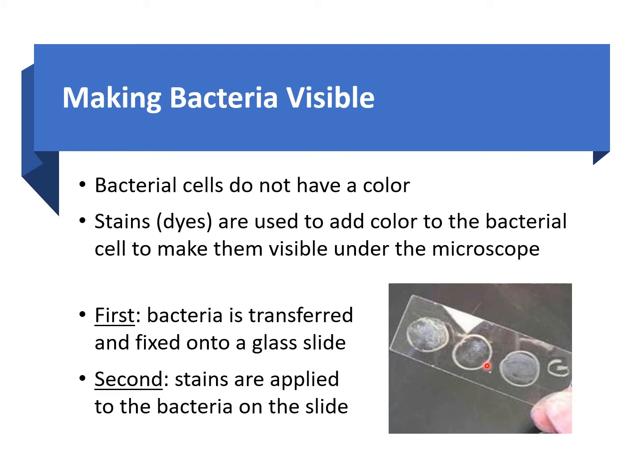So they know that they need to focus right here within that circle that they've drawn. But as I said, if you're only going to put one sample of bacteria on your slide, you don't have to draw the circles at all.